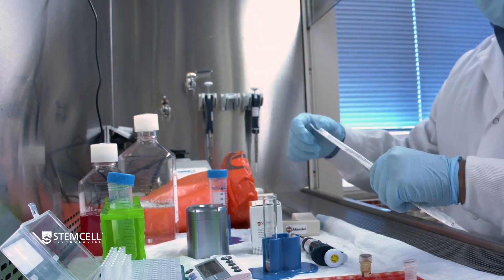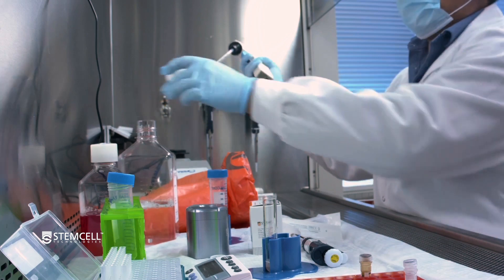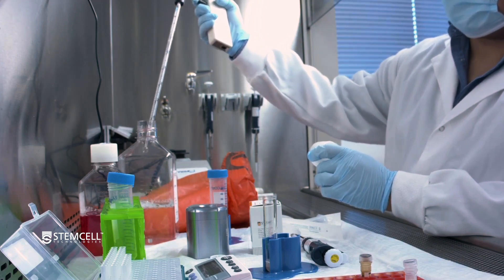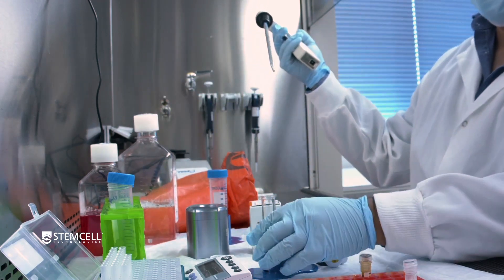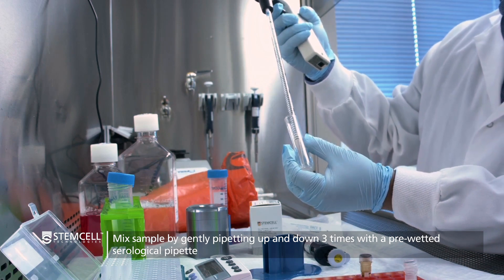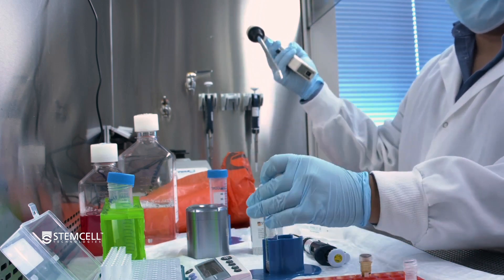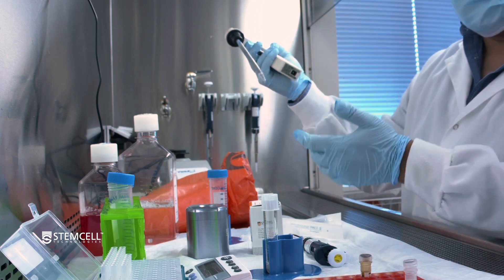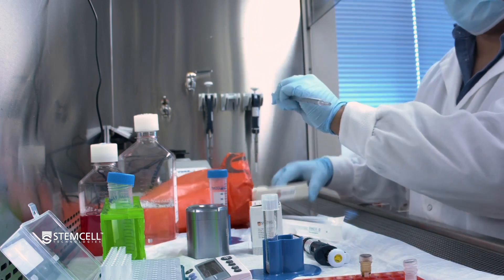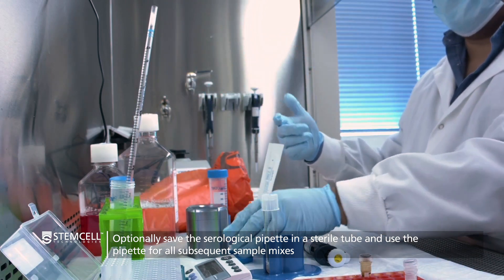Having added that reagent, you oftentimes want to follow that up — especially if you're working with larger samples — with a mix using a serological pipette. It's also not a bad idea to pre-wet your pipette, especially if you're recovery conscious. If you're being particularly recovery conscious and your safety regulations allow, you can save this serological pipette in a sterile tube, since you can then use it for all the subsequent reagent mixes.